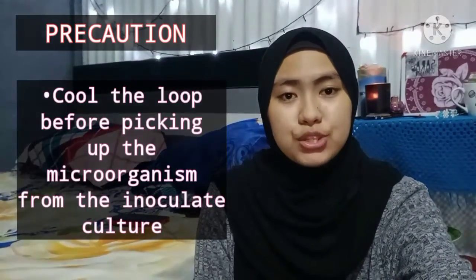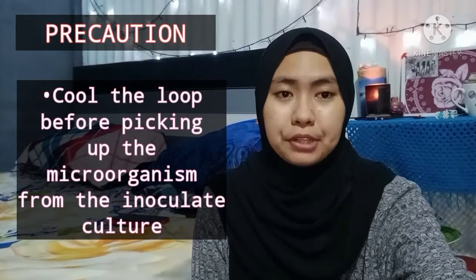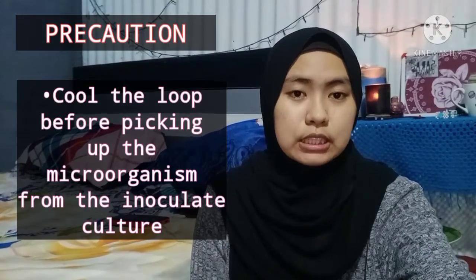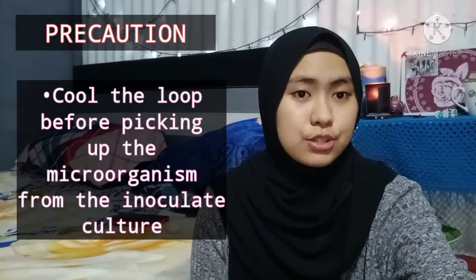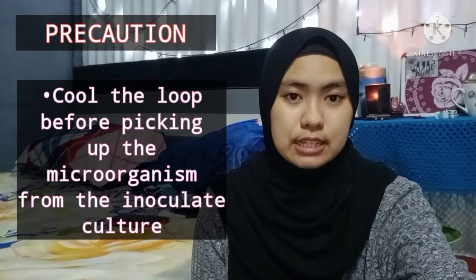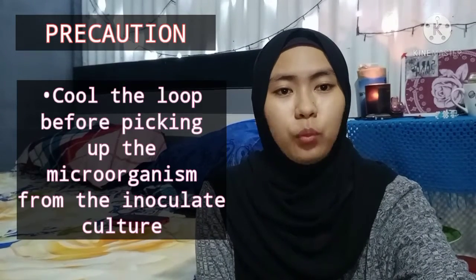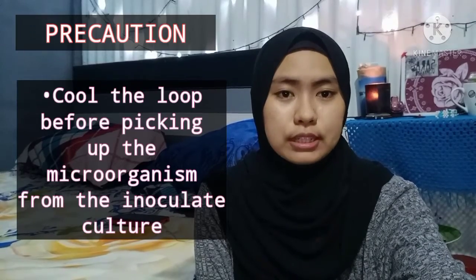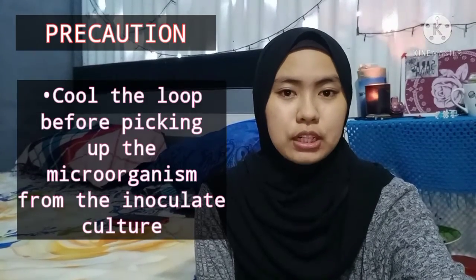Thirdly, make sure to cool the loop before picking up the organisms from the inoculum culture. The loop can be cooled by letting it touch the very edge of the agar before contacting the inoculum. The reason why the loop needs to be cooled first is to avoid killing the microorganisms that are in the culture.